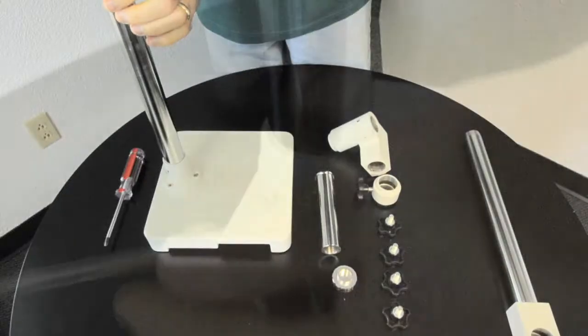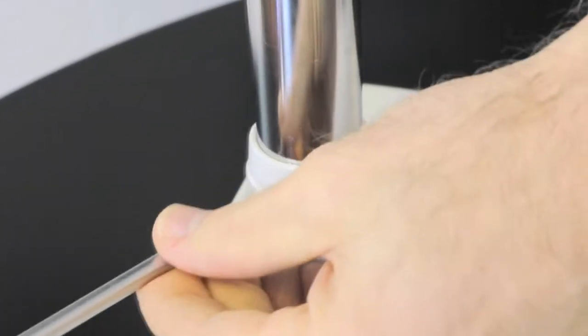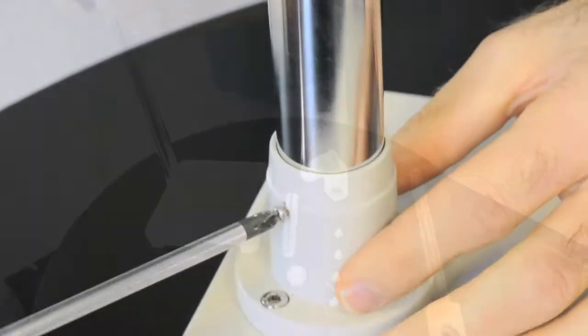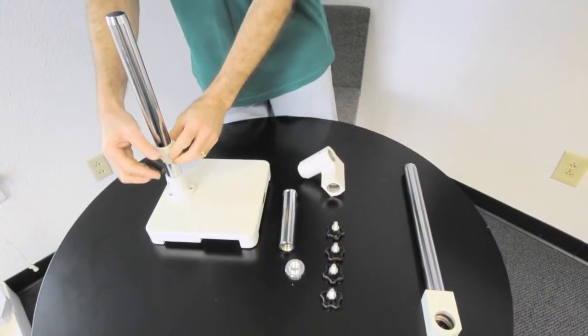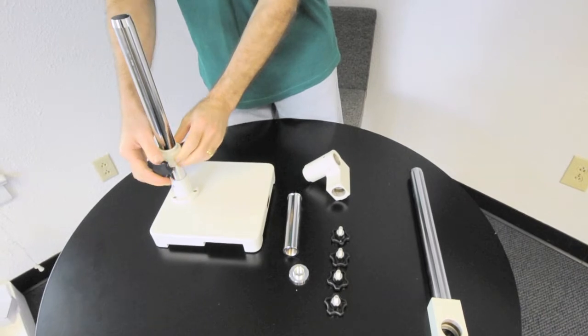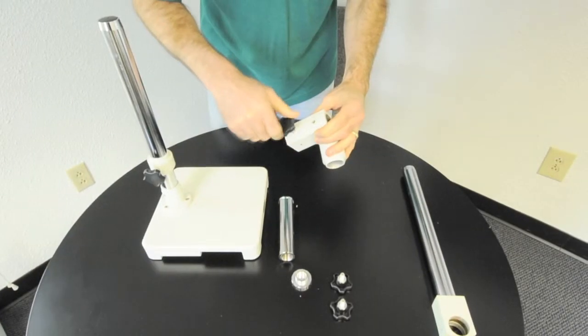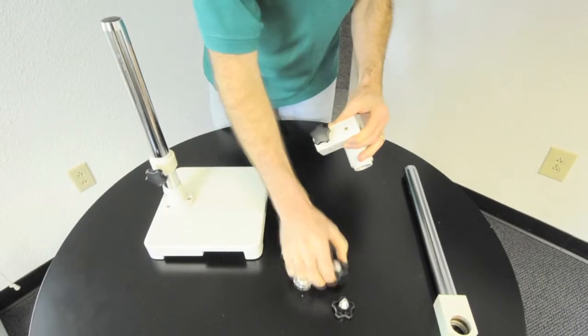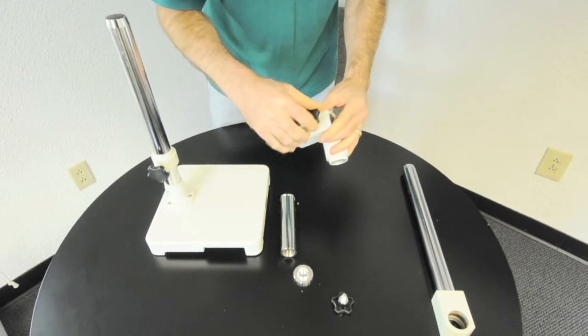The vertical post screws firmly into the base and then is retained by a supplied Phillips head screw. The safety collar and attachment block then slide down over the vertical post. These are fixed in place by the provided screw knobs.